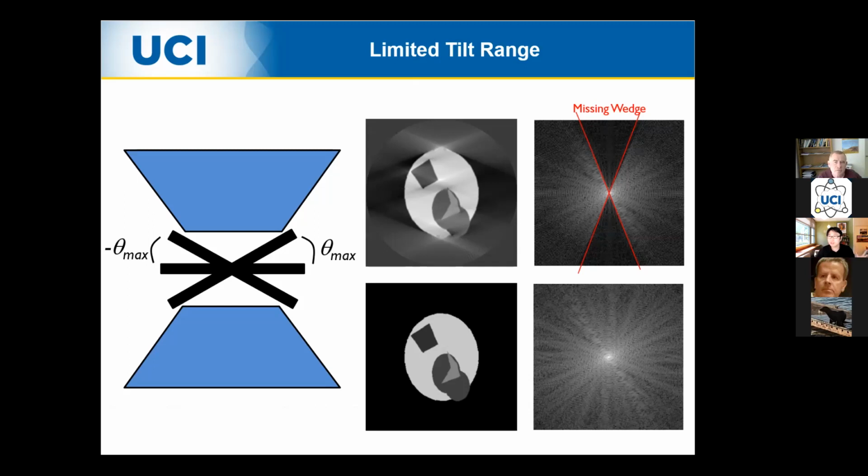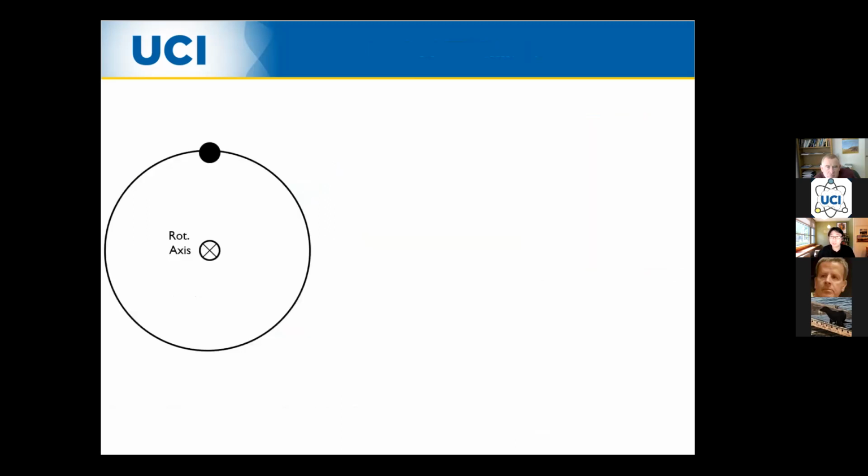And that solution actually does not conform to the original object, right? So the question is, how can we take one solution that's reasonable, that looks similar to the previous one? Traditionally, what's been done is to use regularization terms. And here I'm going to show you that you can actually do it with machine learning. So you don't have to specify the regularization terms mathematically. Everything is embedded in your training data set, right?